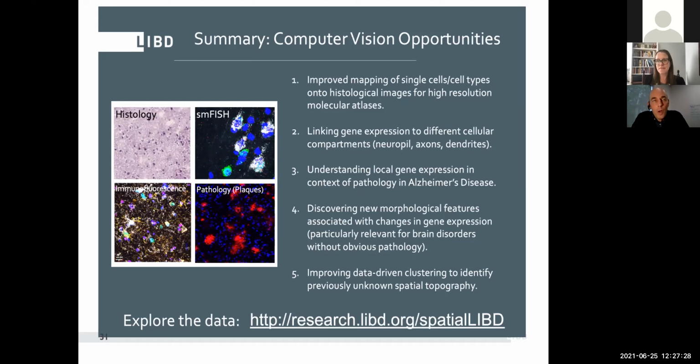In this presentation and in other presentations earlier, there's clearly a benefit in grouping and averaging. But one of the issues in the nervous system is that there's incredible local cell diversity, and when one defines a spot as a certain cell type, or it has a very high signal from a certain cell type, of course the mean signal is dominated by one cell type, but there are neighbors that are influencing that.